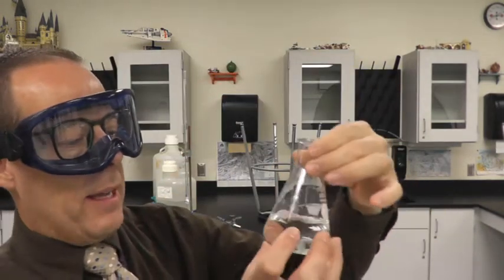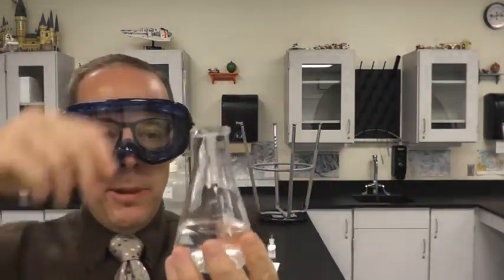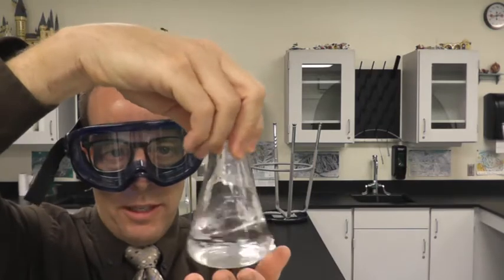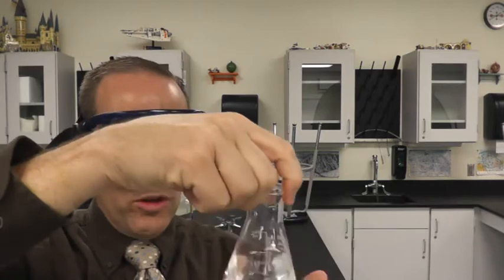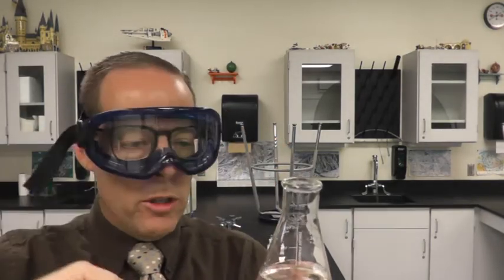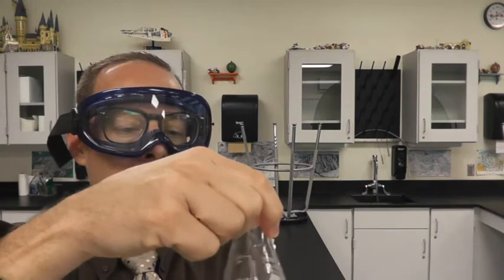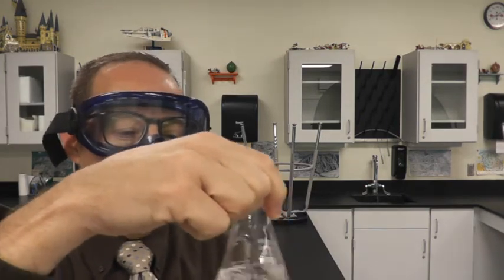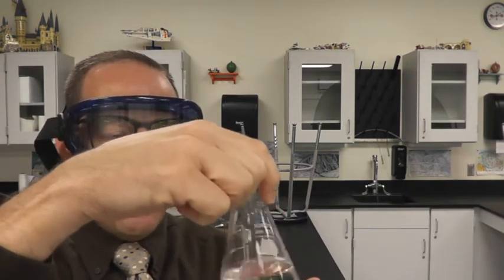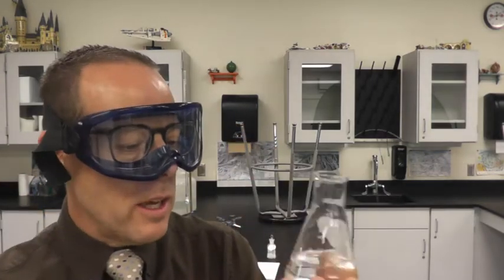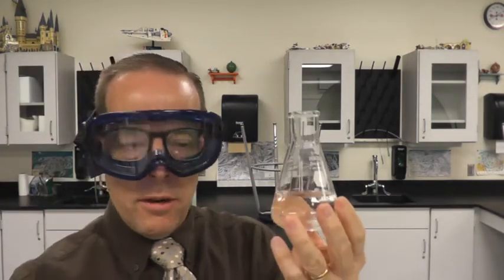So I am back. And so Erlenmeyer flasks are shaped like this so that you can swirl it and hopefully the liquid doesn't come up the sides. If we were using a beaker, you have a tendency to, if you're swirling, because it's vertical, your water spills out or your solution spills out, whatever happens to be in the mixing container. So Erlenmeyer flasks were designed so that you could swirl them. And it looks like most of my KHP is dissolved.